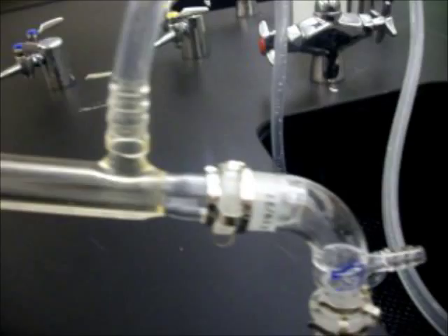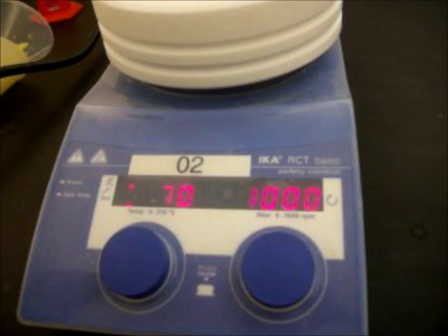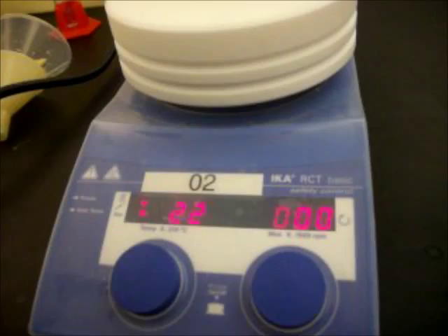Set up, we heat the corn cob mixture and keep it boiling for 20 to 30 minutes. The temperature is set to 270 and the stir rate at 1000 using a reaction block.